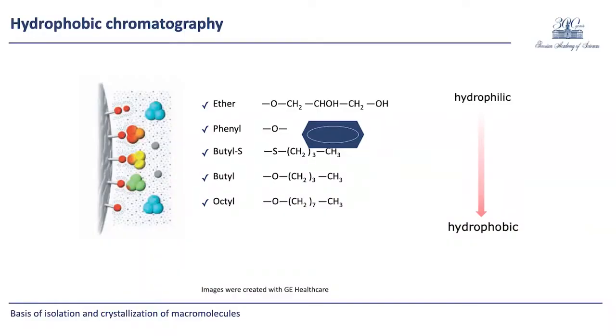In hydrophobic chromatography, the retention of separable substances is due to hydrophobic interaction of their molecules with a relatively nonpolar stationary phase. And to change the elution force of the mobile phase, first of all, a change in the ionic strength, salt concentration, in the mobile phase is used. Resins in hydrophobic chromatography can be divided into two groups, depending on their interaction with the sample.